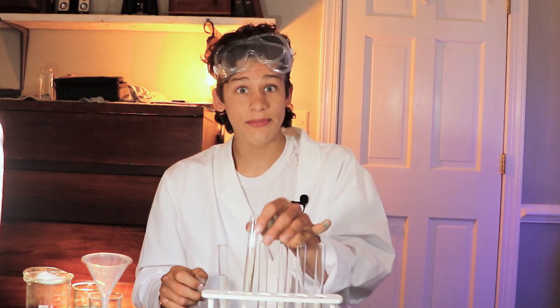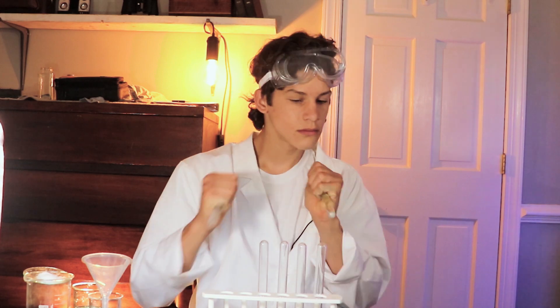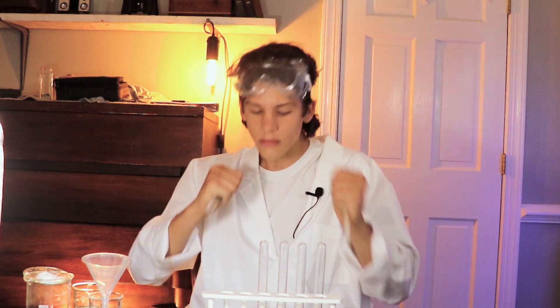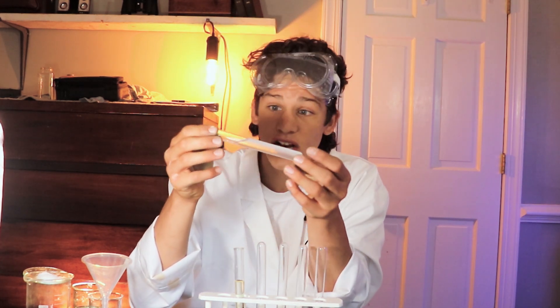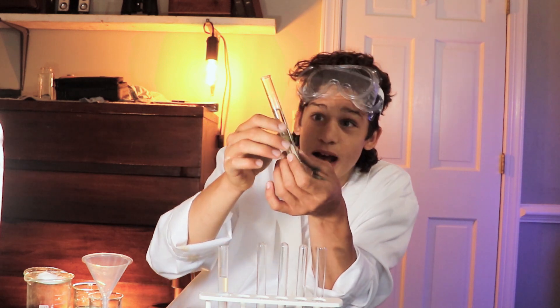After you've shaken both tubes for about a minute, let them sit. Then all you have to do is observe. Looking at the water test tube first, you'll see that all the salt has actually dissolved into the water and there is none left sitting at the bottom. Taking a look at the oil tube, however, you'll see that all the salt is still at the bottom and none of it has dissolved.